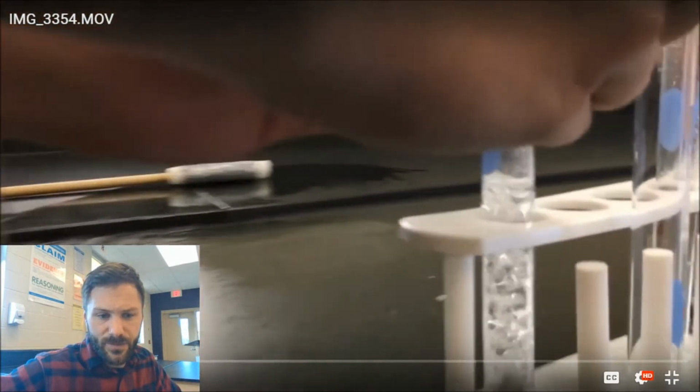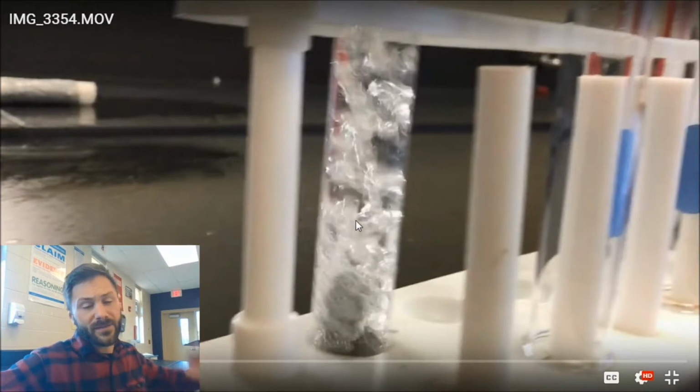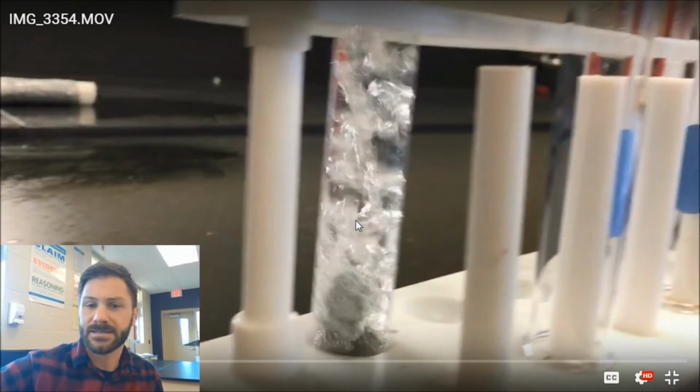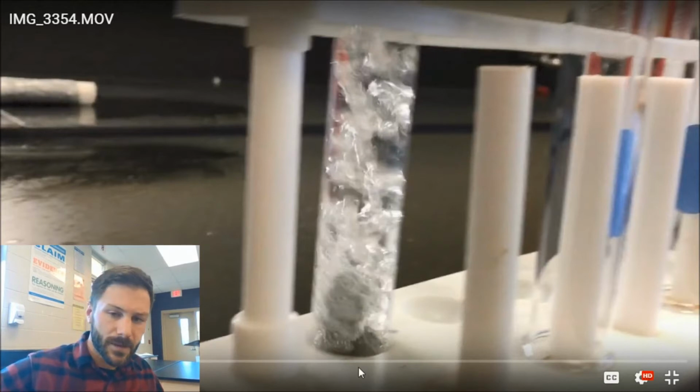Now, as we see these bubbles, and we'll get a close-up here, see all those bubbles, there's obviously a gas getting released in this reaction. So the first question that kind of pops in our head naturally is, what is this gas that's being produced? We're seeing bubbling, it's going up and eventually out of the test tube.